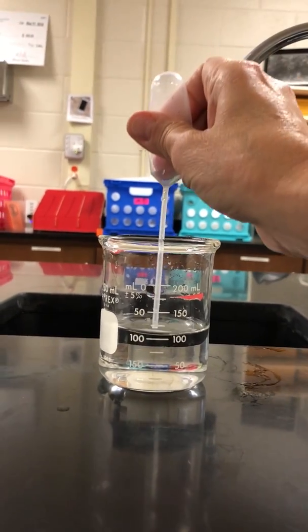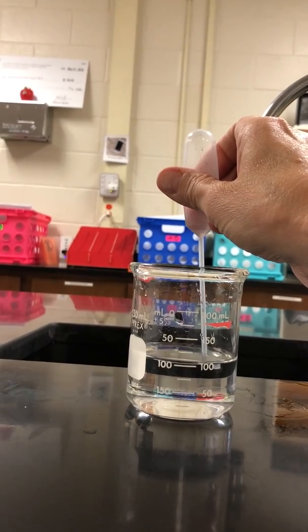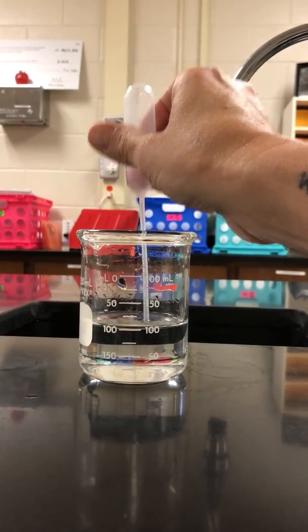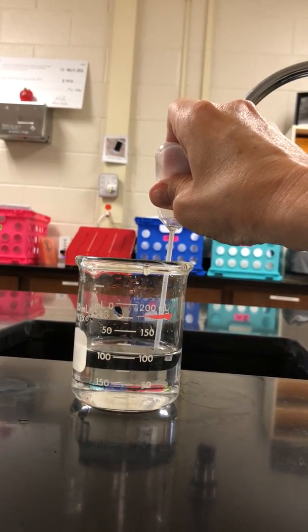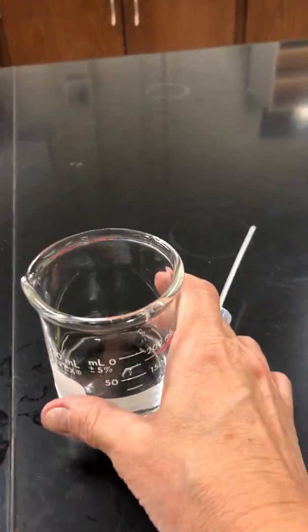All right. So we are going to remove some water. There we go. Beautiful. So we got the water. Sorry, my video is so jiggly.